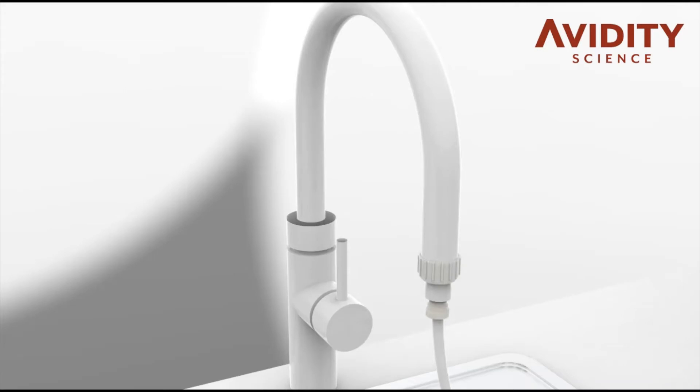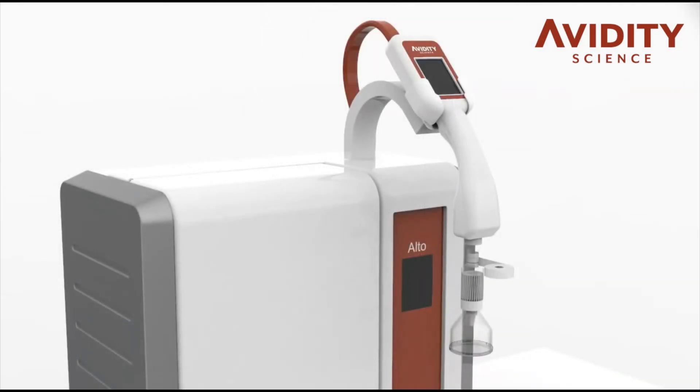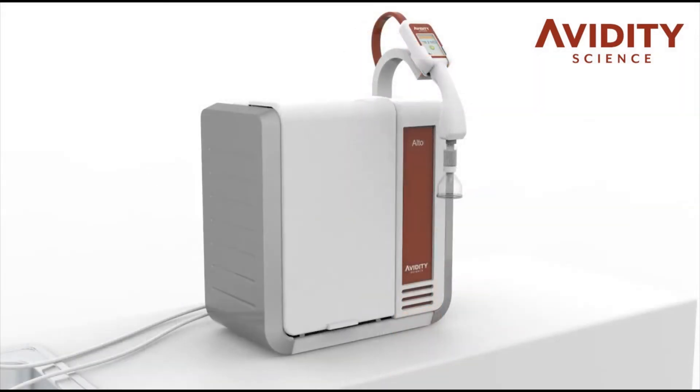To install the point of use filter, first wrap four to five turns of the PTFE tape provided around the thread and then screw into the dispense valve.